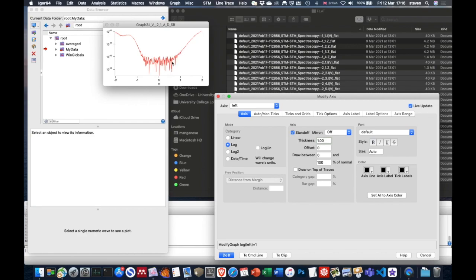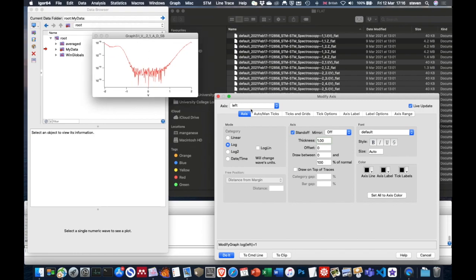So rather than the current going to 0, there's a surface state that comes down here to about 0. On the valence band side, we wouldn't see that, and we'd end up with a band gap of about 0.5 eV, which is what we expect for the surface states of silicon. So that is, within how accurately we've done this measurement, looking okay.